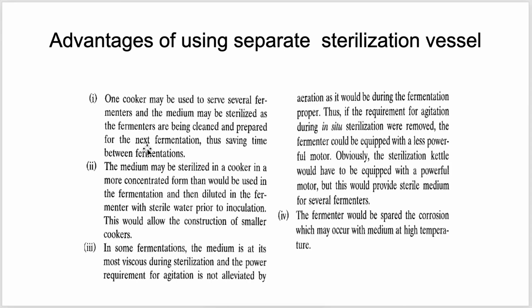Another advantage is, if we use a separate vessel, we can sterilize the media in a more concentrated form. So basically, we sterilize more concentrated media, and then we dilute it using sterile water, and then we supply this media into the fermenter.